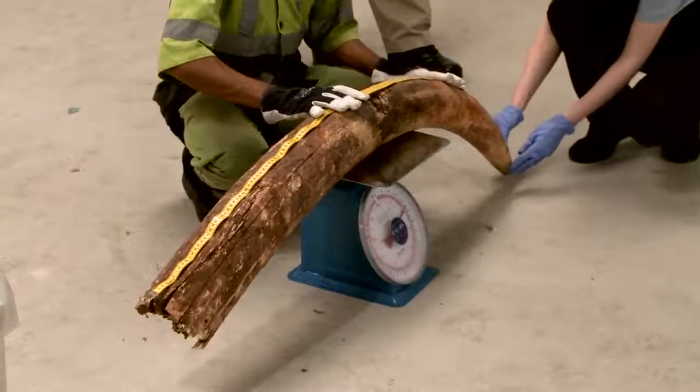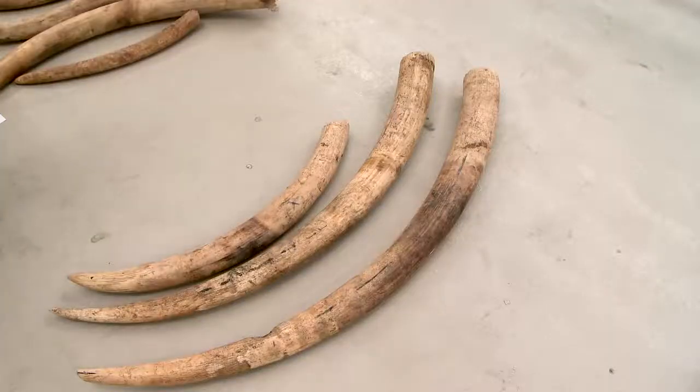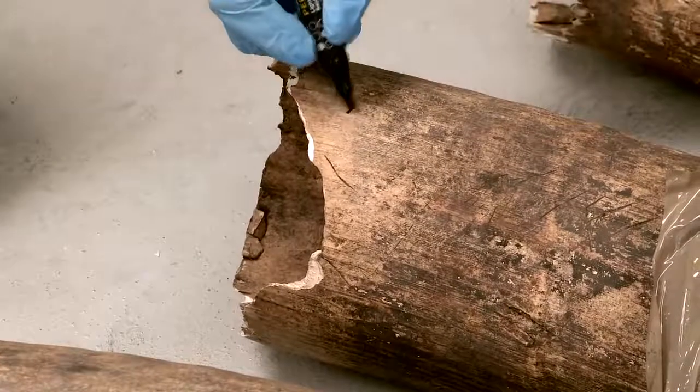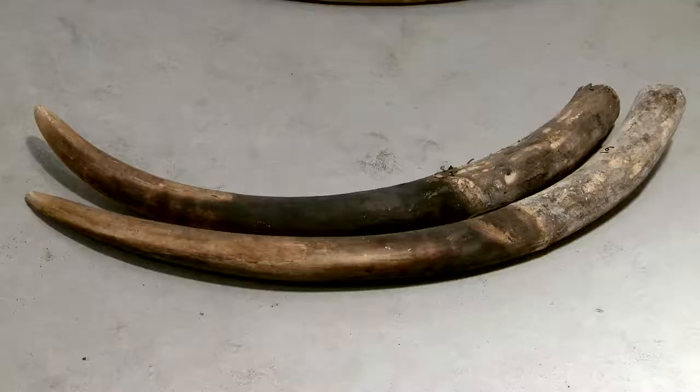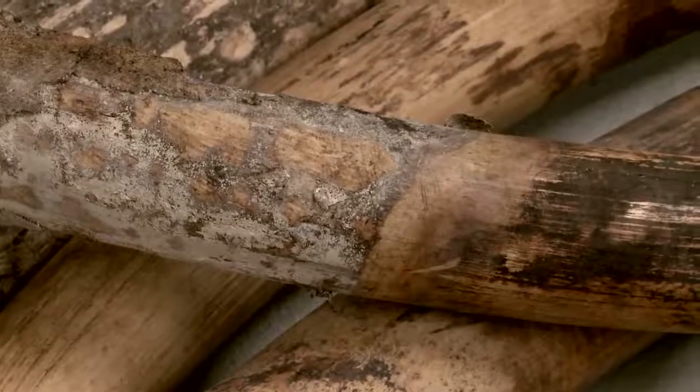It's best to analyse only one of the two tusks from the same elephant. Arrange the tusks from smallest to largest, using the diameter measurements written on each tusk. Paired tusks should be similar in size, colour and in the distance between the gum line and the base. The gum line is the mark showing where the tusk protruded from the skin.